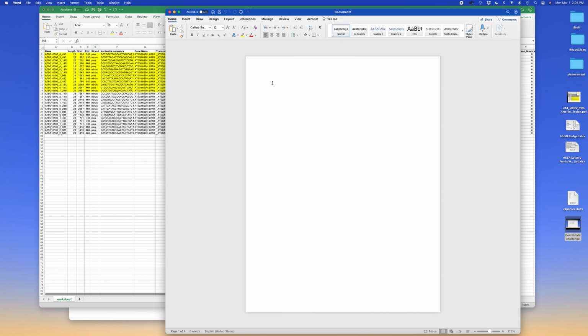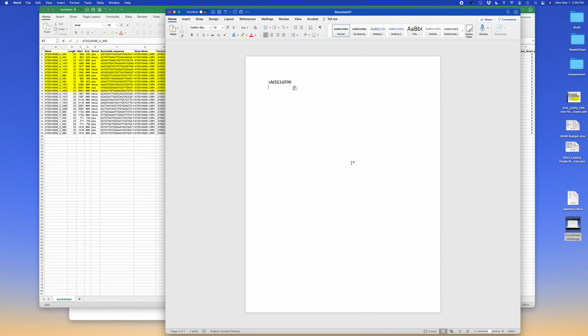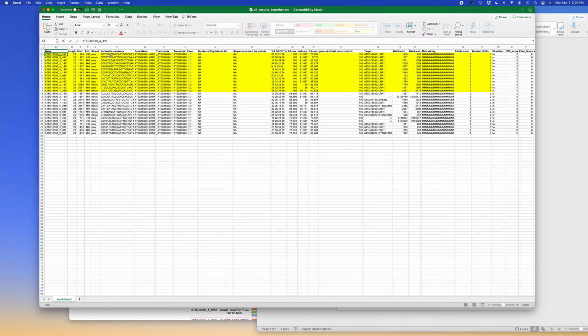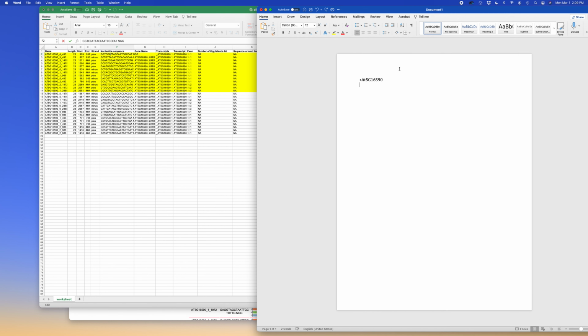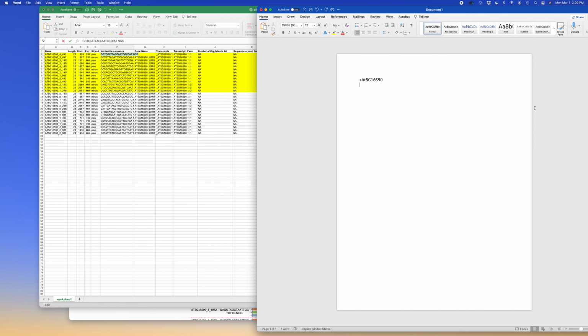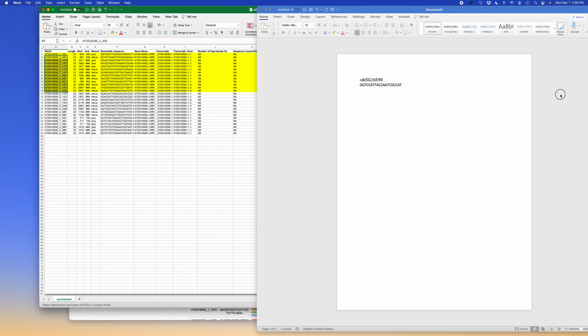So we're going to do angle bracket, copy, paste, and then copy the sequence of that, and then remove the NGG, like that. Do this a few more times. Actually, this might speed things up.